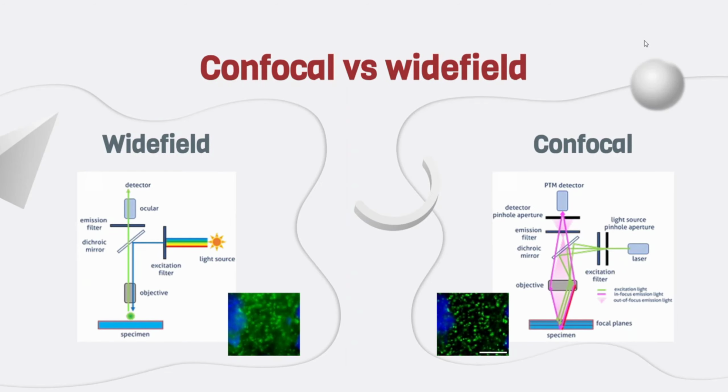Confocal microscopy is one of the most widely used optical sectioning techniques today, offering a powerful balance of image clarity, depth resolution, and ease of use in biological and biomedical research. The main difference between wide-field classical fluorescence microscope and confocal microscope is that in the second one, only the light deriving from the focal plane arrives at the detector, thanks to a detector pinhole aperture. So, the confocal image readily resolves small structures and reduces out-of-plane fluorescence.